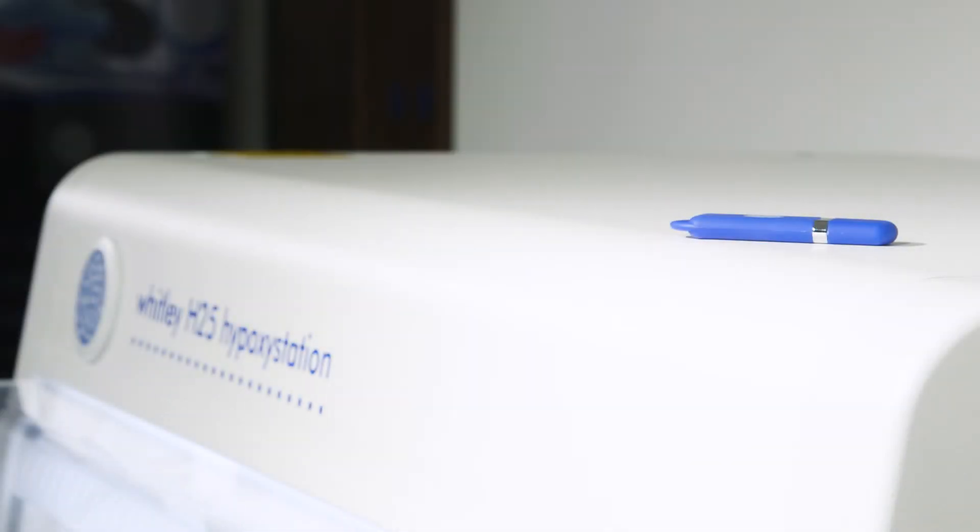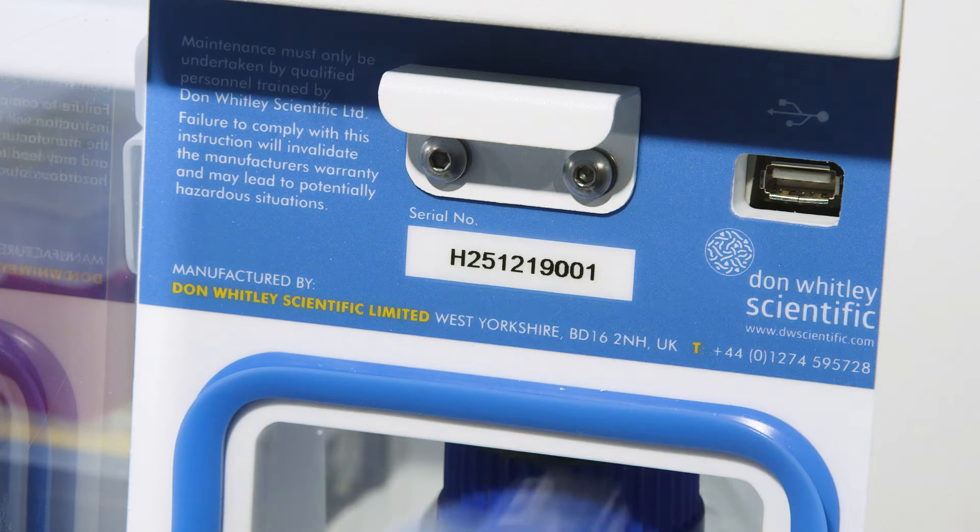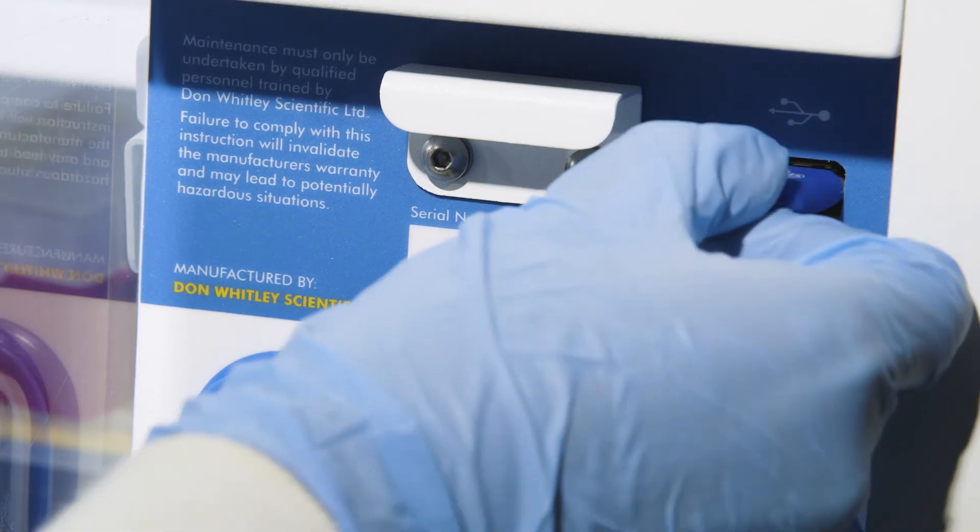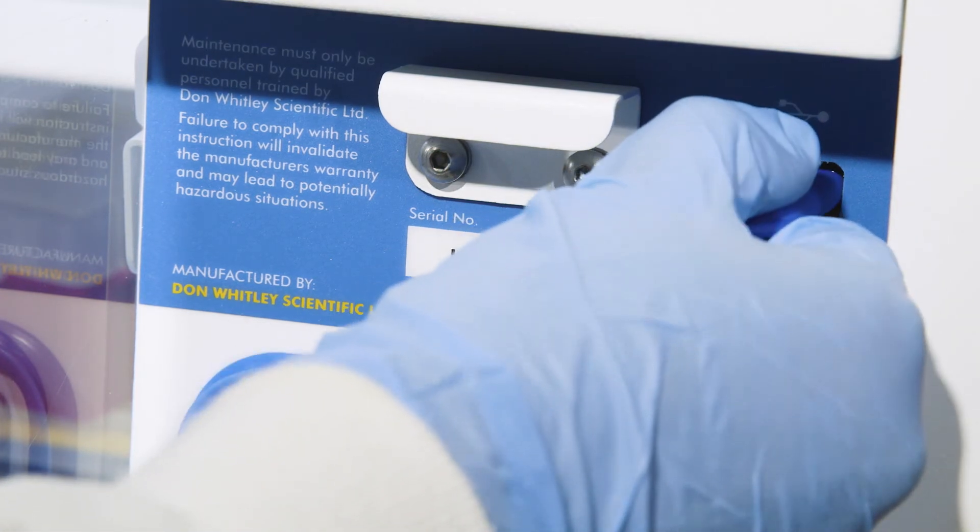The data logging option allows the user to record the data from the environmental parameters inside the workstation. In addition, oxygen profiling allows the user to pre-program different oxygen tensions for a set amount of time.